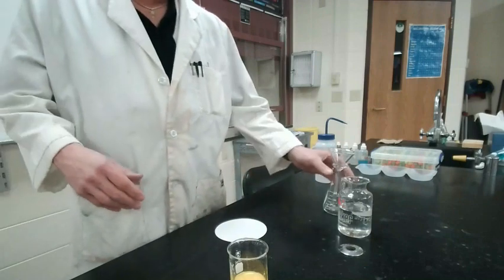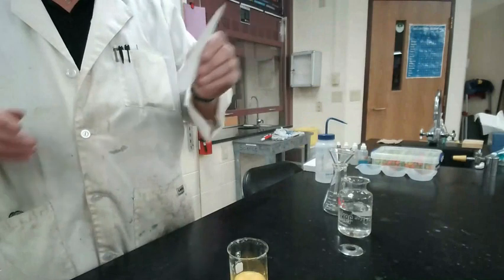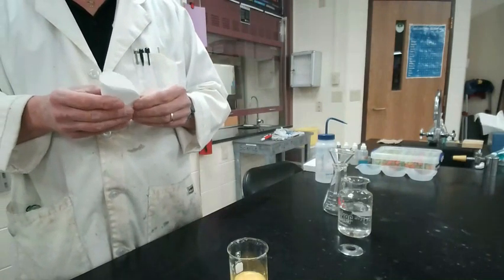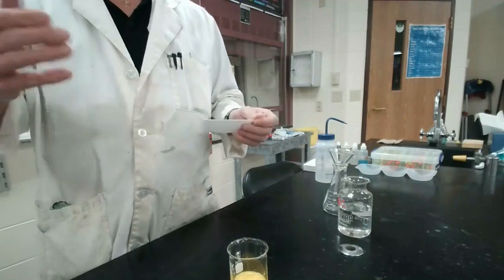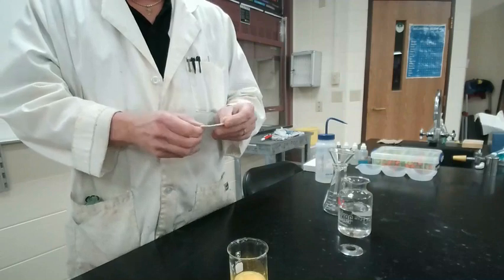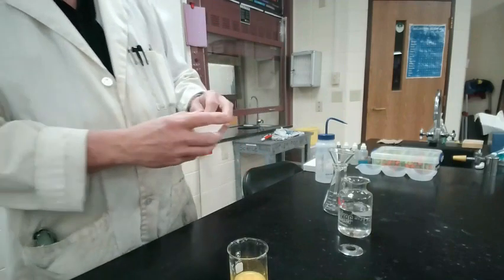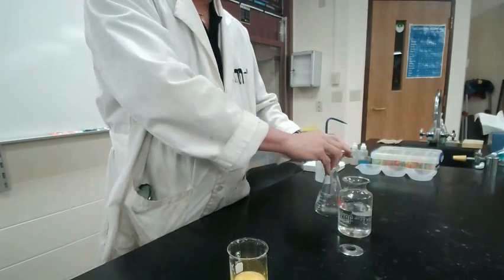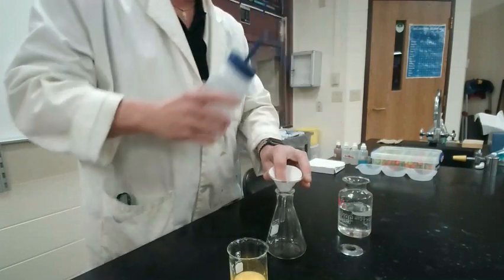But before I do that, they took a piece of filter paper like this, ladies and gentlemen. They put it on a balance and they measured its mass. You will find it in your lab, in the container. I'm going to fold it twice until it looks like a cone. Then we're going to put it inside of a glass funnel, which is inside of a flask.